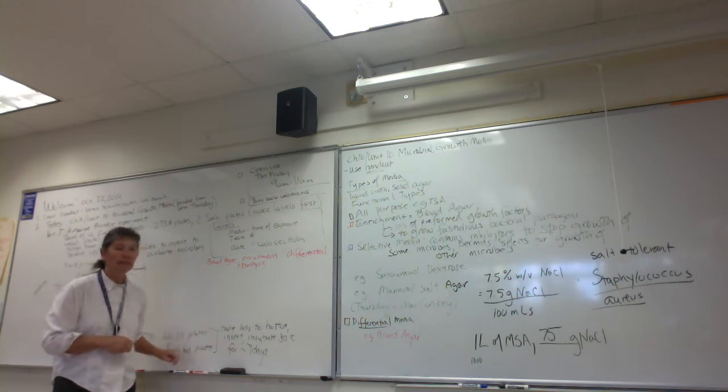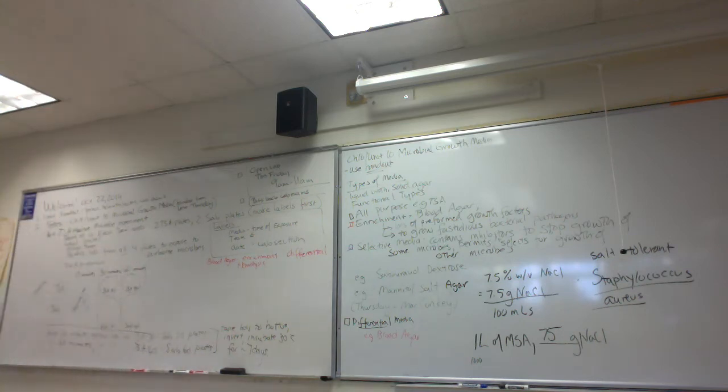So let me get the plate that we did yesterday. And I'll do the same thing today, folks. I asked for 4 volunteers, and from 2 of your colleagues, we did throat swabs, and from 2 of your colleagues, we did nasal swabs.